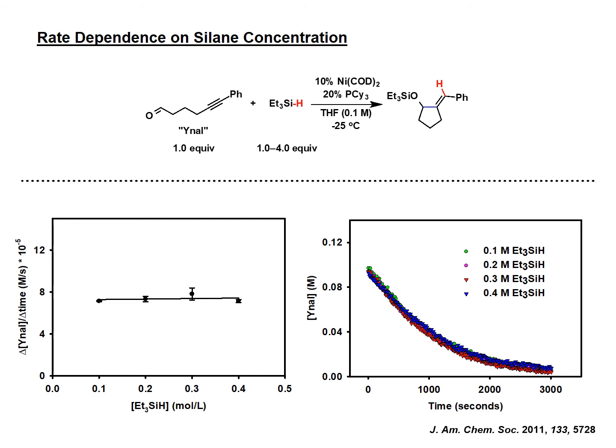But you can take it a step further and look at kinetic isotope effects, because people are interested, okay, well, if there is a possibility for direct insertion into the silyl hydride or silyl deuteride, you could be able to see a kinetic isotope effect. In a competition kinetic isotope effect using excess of each reducing agent, in the NMR, you measure as close as you can get to 50-50 mixture. There's no KIE.